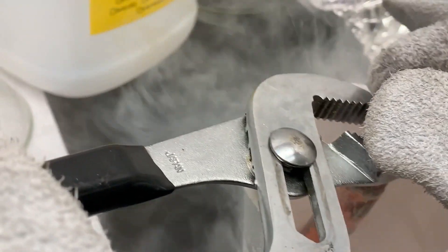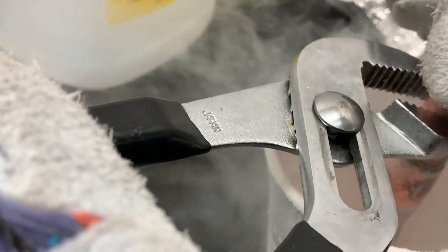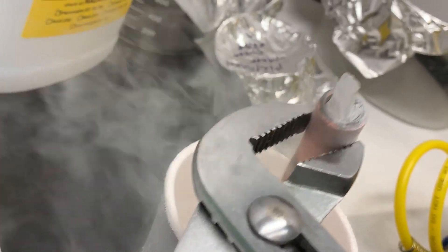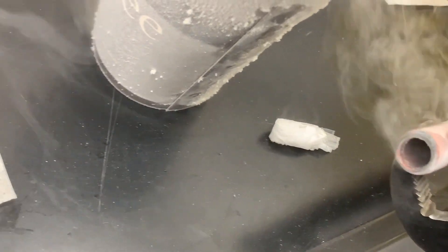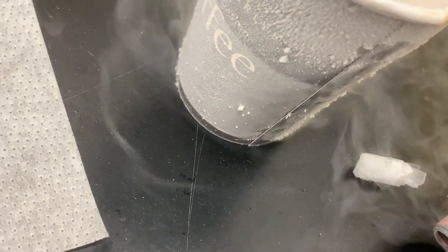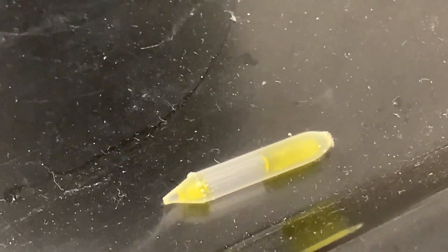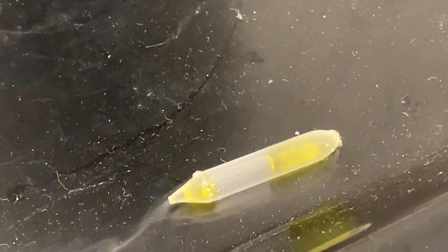It makes you feel like a real scientist. There's the solid chlorine. Look at that — solid Cl2. I'm getting a really good shot. We won't need to do this again. Oh, it's melting. Look at that — solid chlorine is melting.